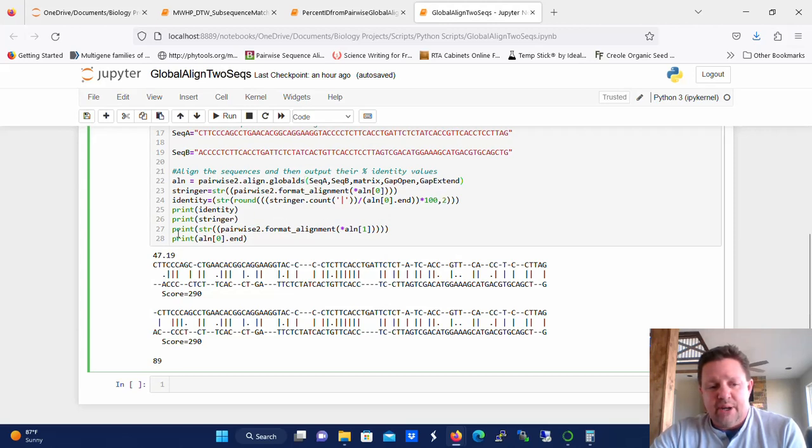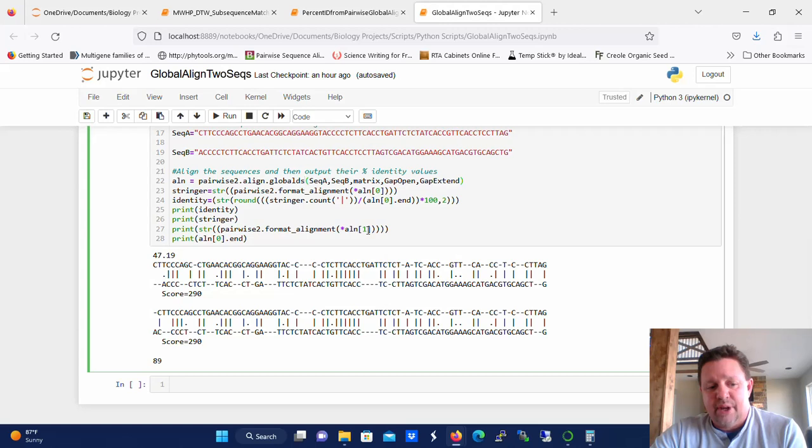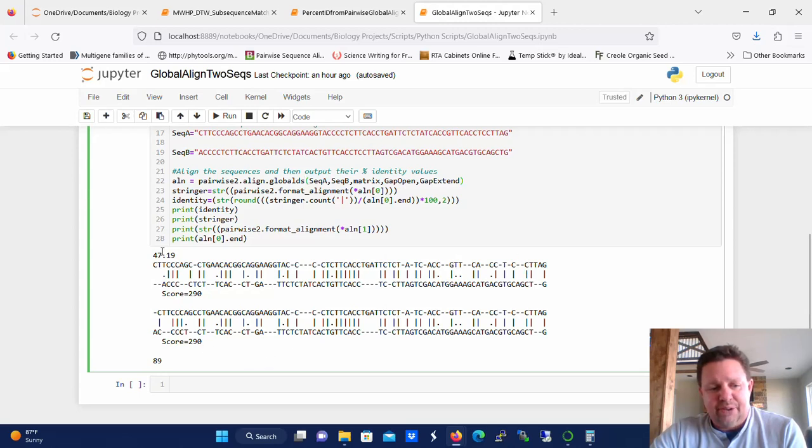So you can see right here that for this particular alignment, it calculates to 47.19 percent identity. And then at that point, we just use the print command, and we print the identity, we print the stringer here, and then also have it printing the next best alignment, the second alignment that scores equally well to the first one. So you can see here that this top alignment is gapped differently than the second alignment, mostly at the ends, or at the start. Internally, it's gapped pretty much the same, and even at the end of it, it's gapped pretty much the same. But it differs here in how it started. So it's really not that significant.